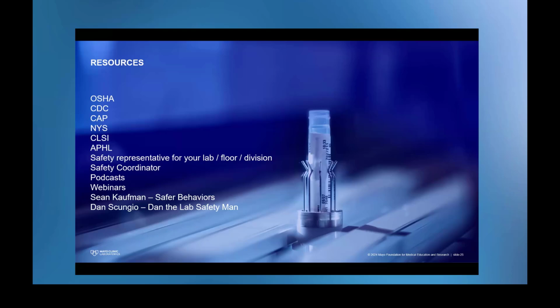The other thing you want to keep in mind is that if you are a high quality laboratory using standard precautions of lab coat, gloves, safety glasses, and then a face shield if you're manipulating specimens on the open bench top, if you are using good technique and if you are using all your PPE appropriately, the risk of exposure to something even as bad as Ebola is very, very small because you've got all the safeguards in place. When things happen, like you're rushed or you're careless or trying to move too fast and splashes occur and you don't have that PPE, that's when that's a problem.